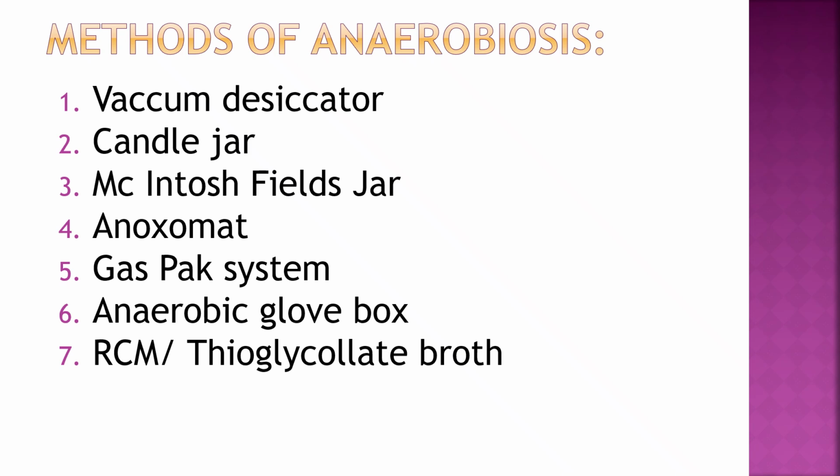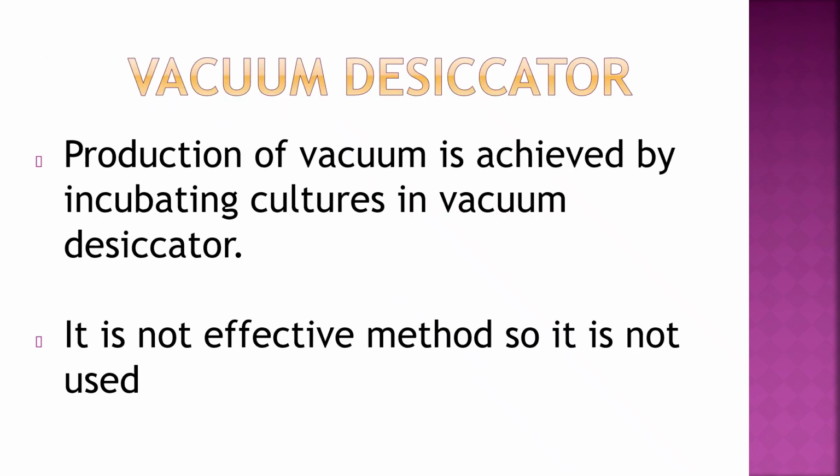They are vacuum desiccator, candle jar, McIntosh Fildes jar, Anoxomat, gas pack system, anaerobic glove box, and RCM or thioglycolate broth. So RCM means Robertson cooked meat media, or thioglycolate broth.